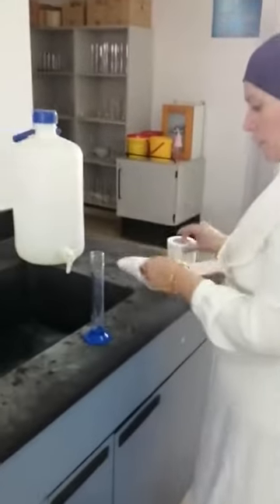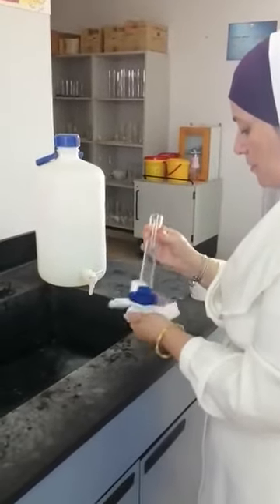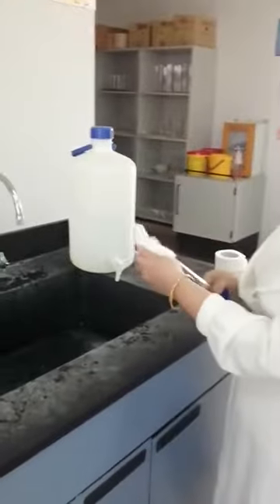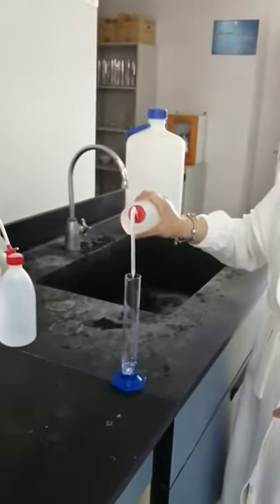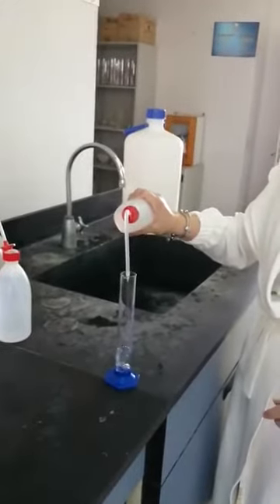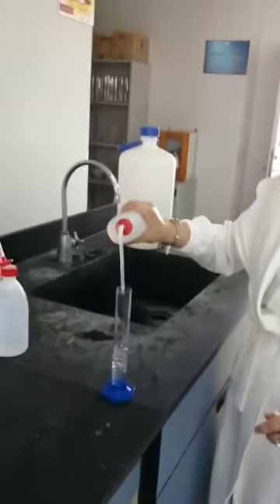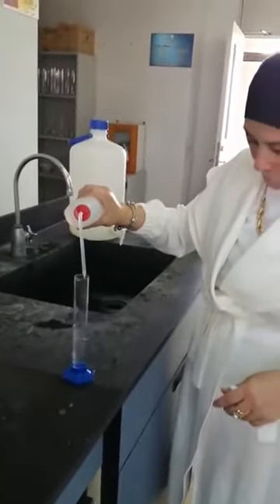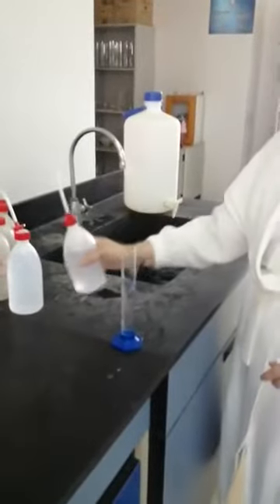Dry it from the outside to get accurate results, and dry the base, just adding 50 ml of water. And reweigh it as W4.